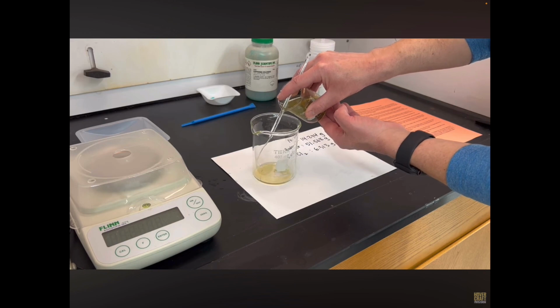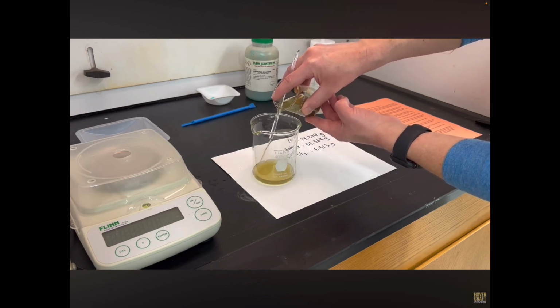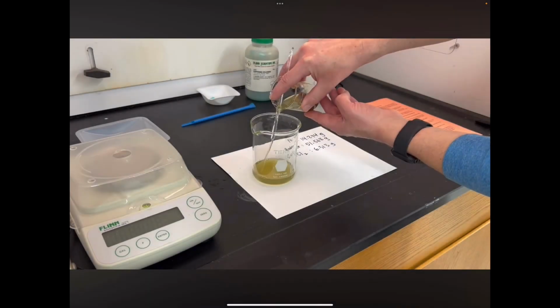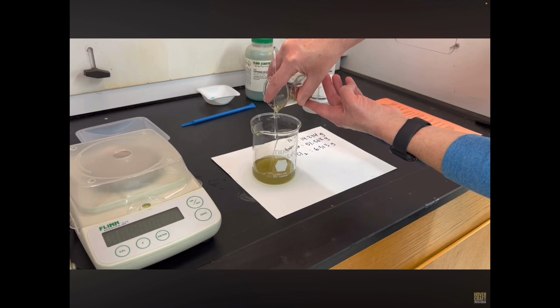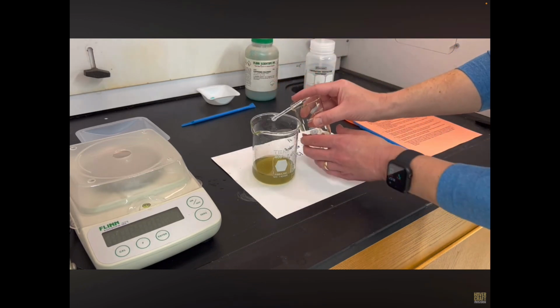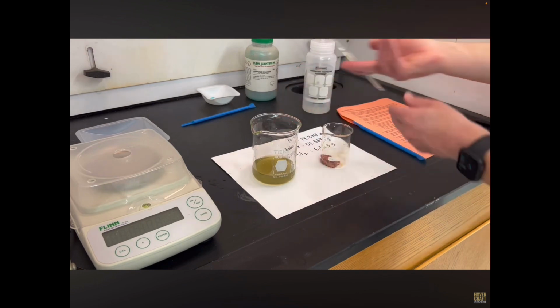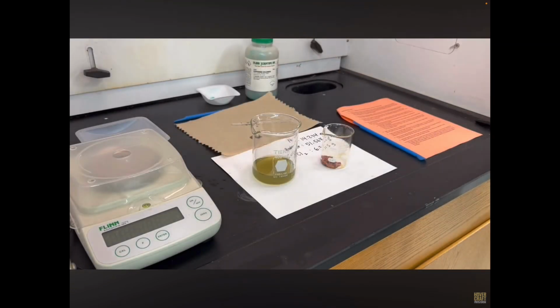Now I'm going to lose some copper at this step. I'm going to try not to, but chances are you may see some fine particles of copper pour out of the beaker. And the idea is I want to pour a good amount off in that first step, but I don't want to pour it so rapidly that I lose a bunch of the copper that formed. So I have a good deal of copper in here, and I want to clean it over the next couple of steps.